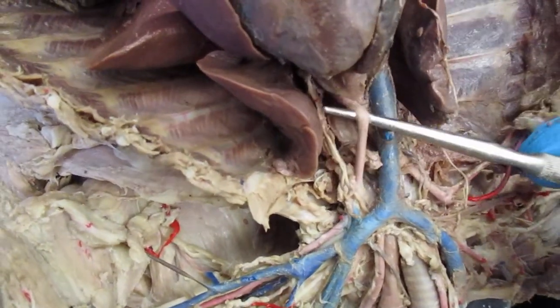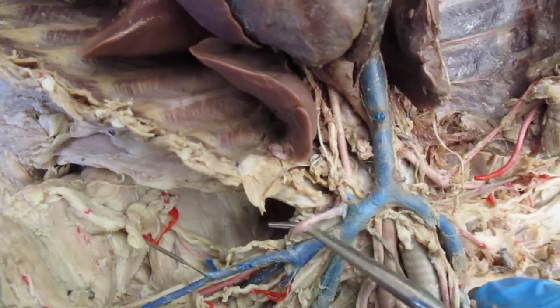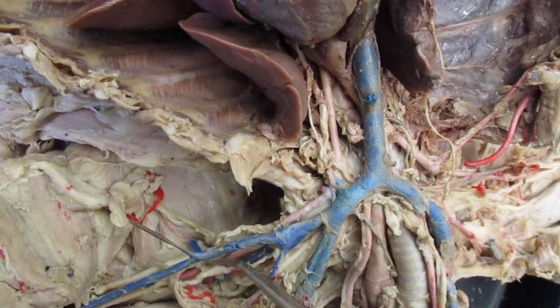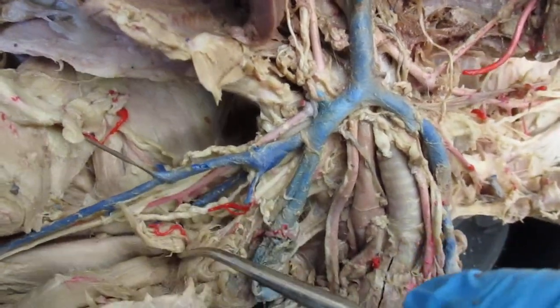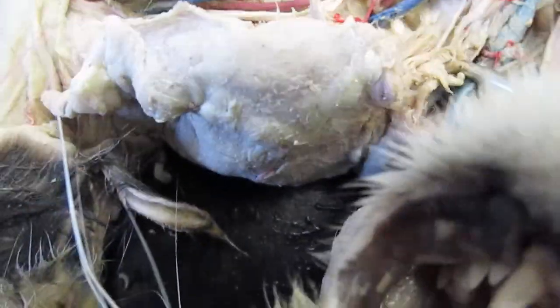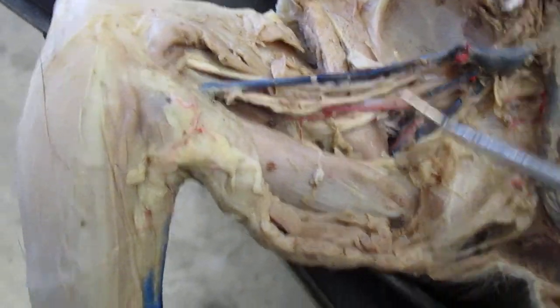Left subclavian artery. And we can see that it's going to go into the axillary and then the brachial, as we see here. And then we can see, let's see, can't find it on that side. Might need to go to another cat. Yeah, right here. Again, sorry about switching cats on you.